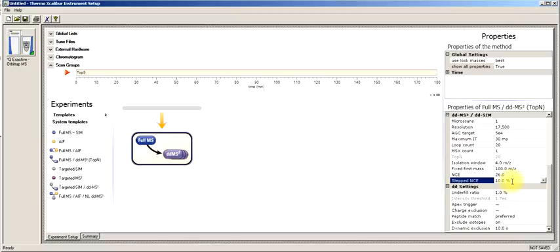So essentially, you'll collect the ion 3 times, and the first time the ion is collected, it will be fragmented at 23. Those fragment ions will be collected. Then we'll fragment the ion at 26, collect those ions, fragment the ion at 29, collect those ions, and then we'll read all the fragmentations in the Orbitrap altogether.